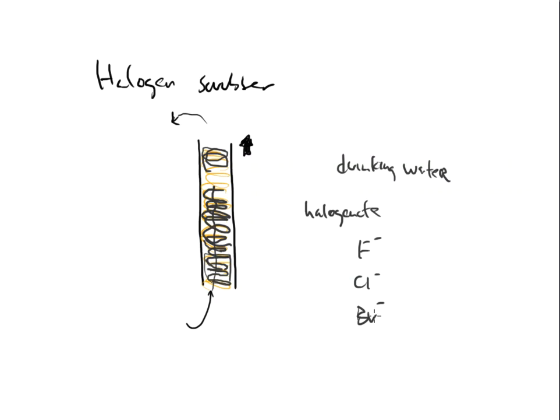but if there's any traces of these halogens, then this scrubber will remove them for the same reason and the same purpose, right? I mean, that water source had to come from somewhere. And hopefully these are extremely low levels. And these halogens will not be present in ultra pure water, but the pharmaceutical company will still have to check it. They'll still have to check to make sure it is ultra pure for them before they use it.